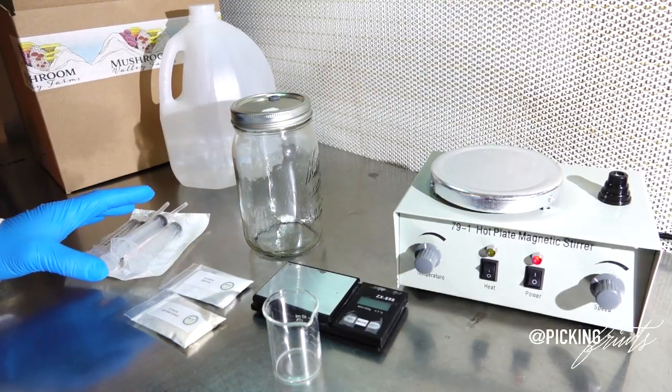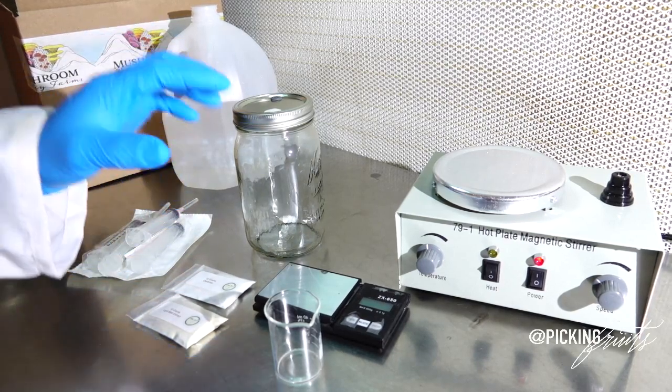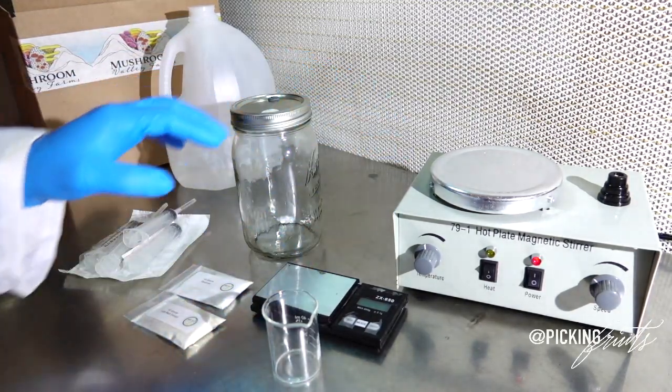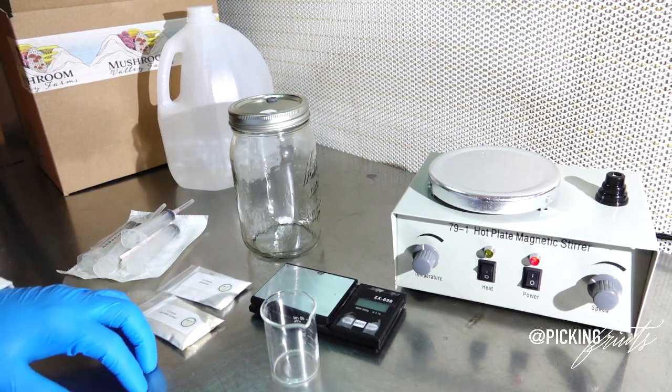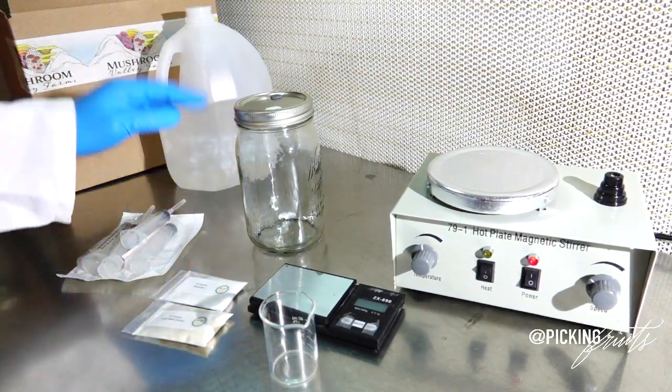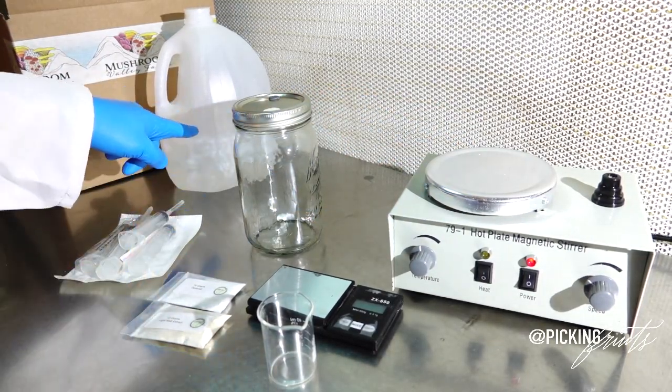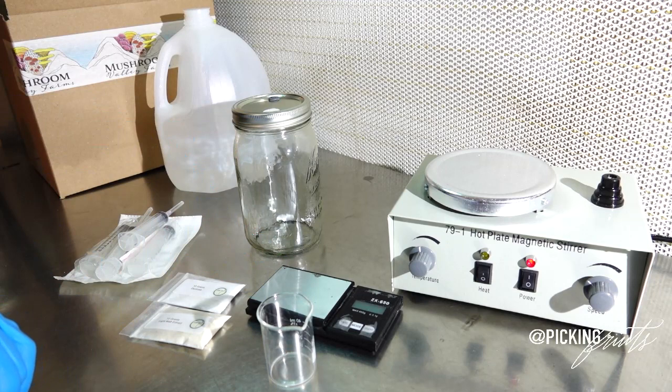Alright friends, so now we're actually going to be making the liquid culture. And one of the things that I really enjoy about this kit is that everything is in one place. So everything has already been sourced for you. All the hard work has already been done. You get the vessel, you get the nutrients, you get the syringes, you get the luer locks, you get the stir plate. The only things that you have to provide are water and the scale to measure your nutrients.